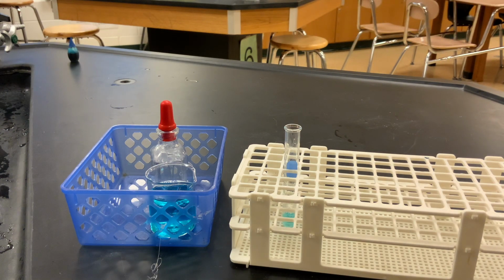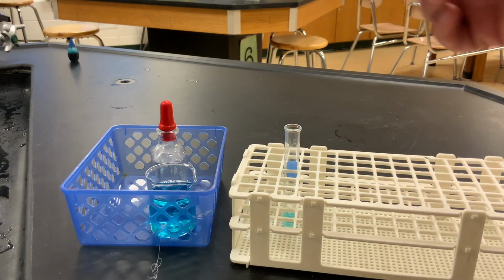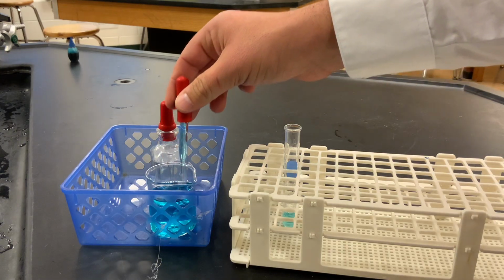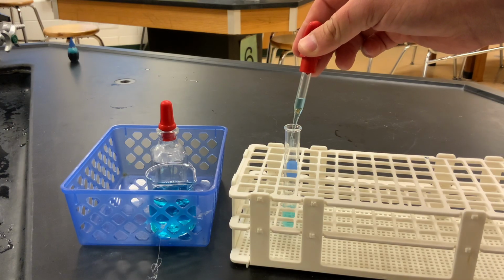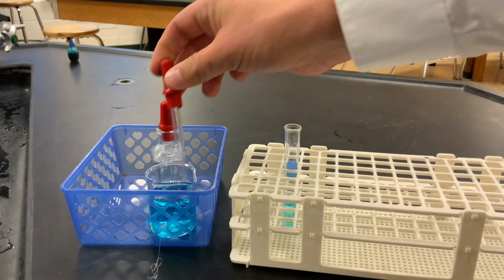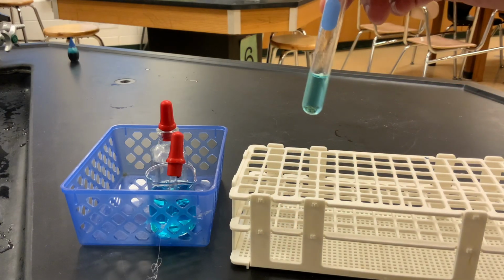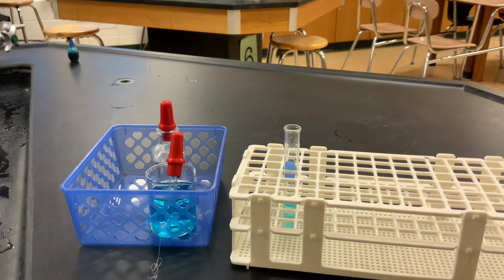Be very careful not to touch the inside of the test tube because you potentially mix other substances, especially once you've added the water. We don't want to mix the water with other things that we're testing. So you're going to fill it, use 2 dropperfuls is what you'll do. Again, this is in progress. So you have about that much water in this case.